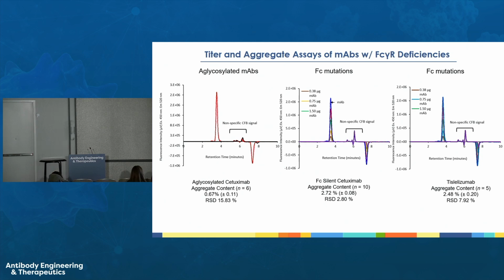Actually, if you look, the slope of the LDR between the aglycosylated and glycosylated rituximab was different. But that probably is because it is recognizing that the Fc region is deformed in a certain way. It's different. But as long as you still get a straight line, and the curve looks absolutely fine, it binds.